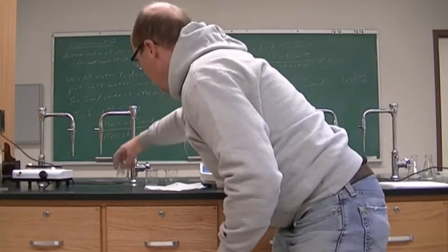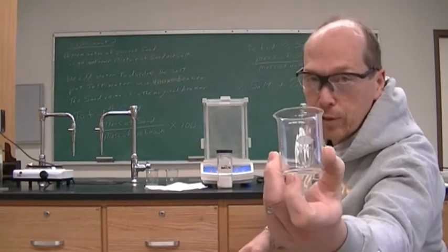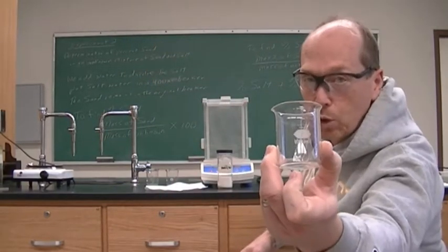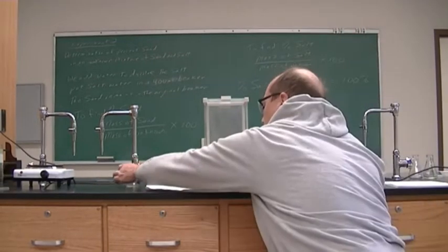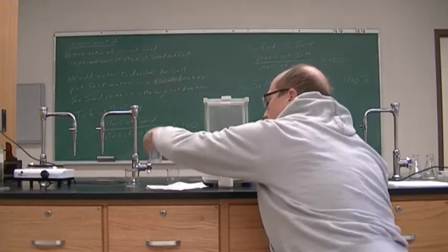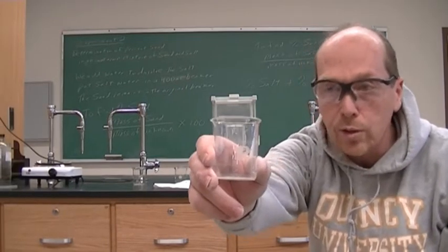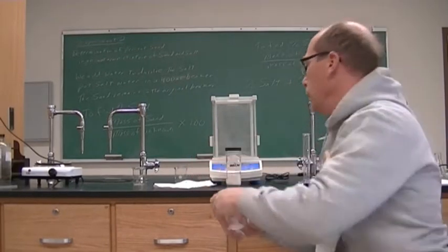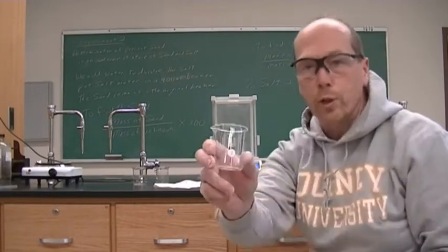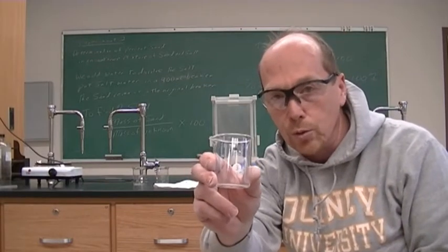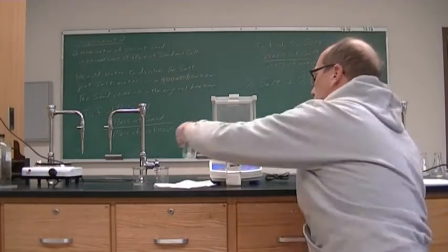I have three beakers and I have labeled them. This is beaker number one — in pencil I wrote a one. This is beaker number two — in pencil I wrote two. And this is beaker number three. It is very important to label your beakers to make sure you do not get them mixed up.